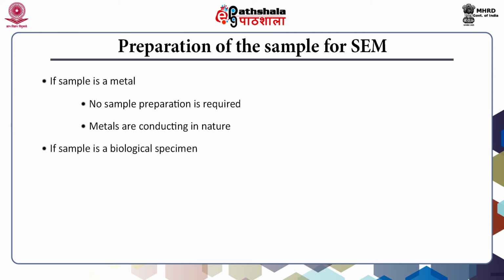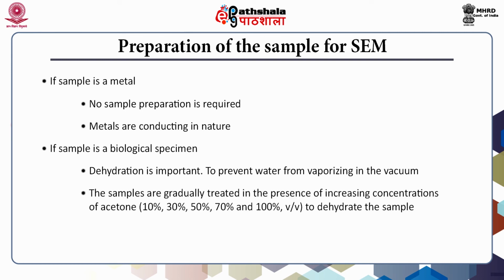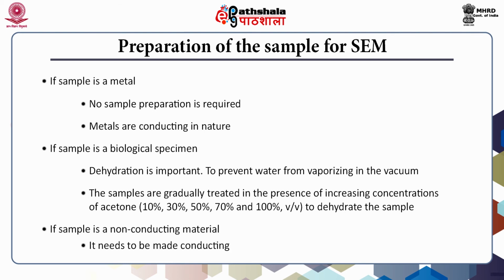For biological specimens, dehydration is important. The removal of water from sample is needed because the water would vaporize in vacuum. The samples are gradually treated in presence of increasing concentrations of acetone, say 10%, 30%, 50%, 70% and then 100% to dehydrate the sample.